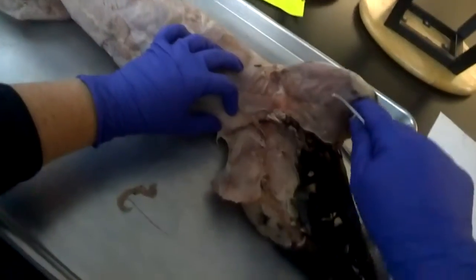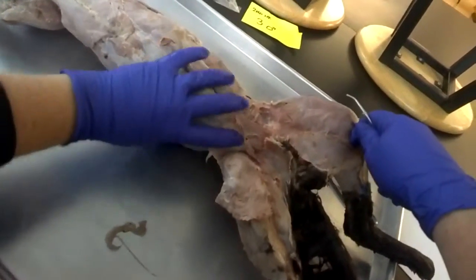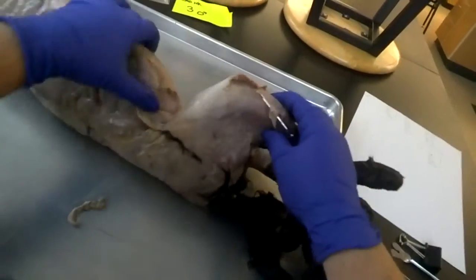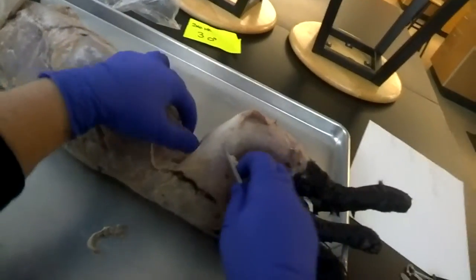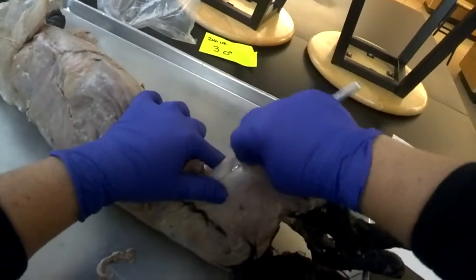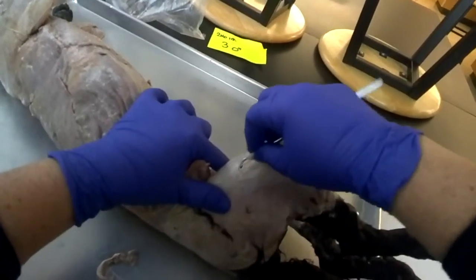Under the sartorius muscle, we have a few other muscles to learn. One of them is sort of on the outside of the thigh, so I'm going to turn the cat over a little bit — it's easier to start from this outside edge. You can see this very, very thick white fascia right in here. That is called the fasciolata.